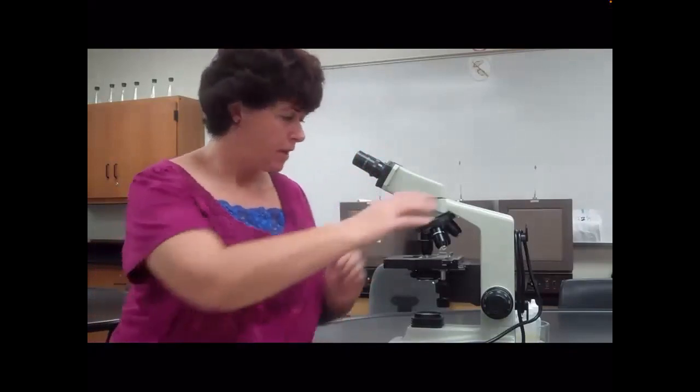When we do the gram stain, you are distinguishing between pink and purple. It may be pink without the oil, purple with the oil. The correct answer is purple. So you have to use the oil immersion.